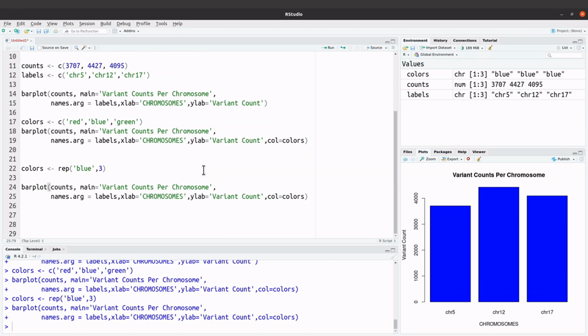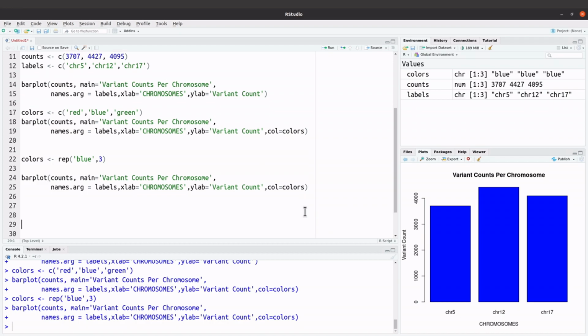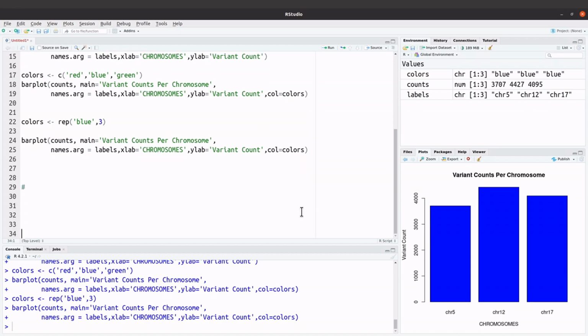Now let's take a look at the germline, somatic, and then the LOH events. So let's do that also here. I say pie chart of germline, somatic, and LOH. Let me make this one uppercase.